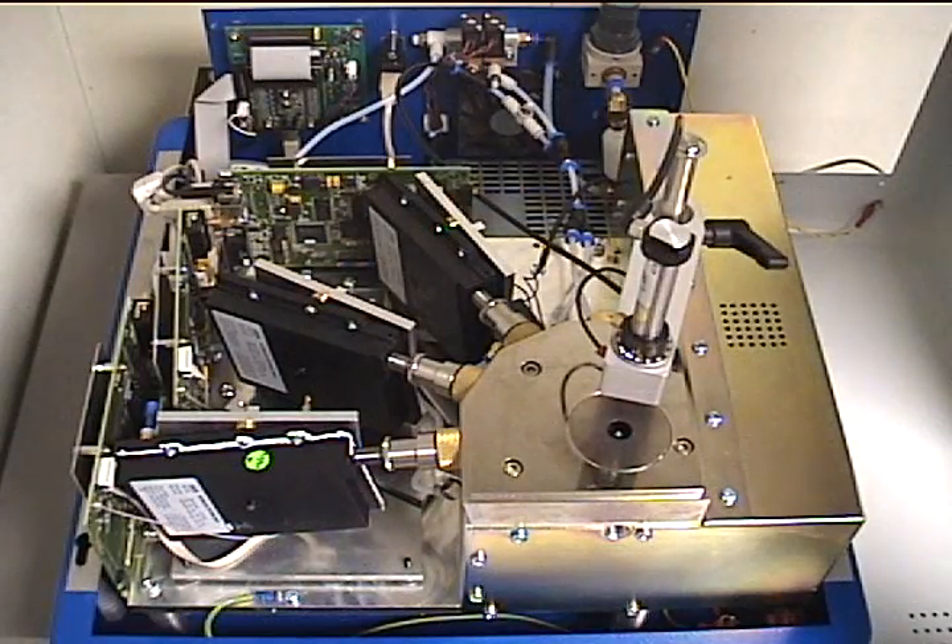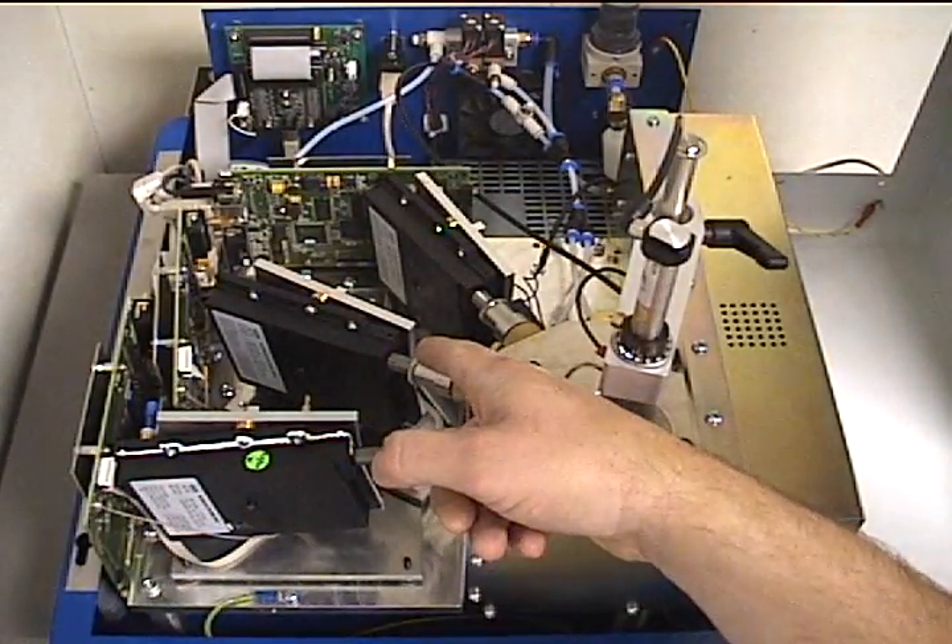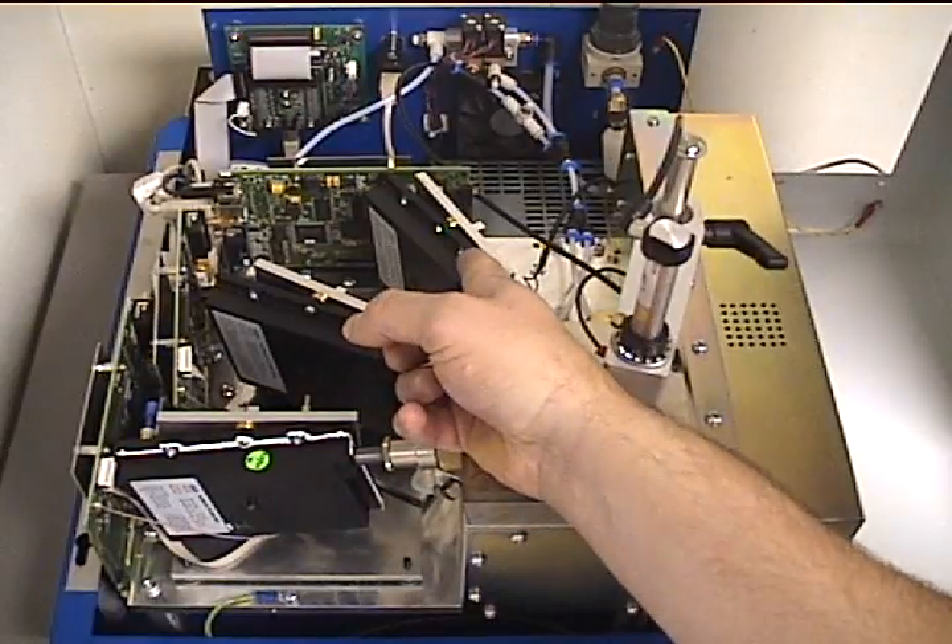Under the hood, the PolySpec is neatly laid out and not as complex as one might think. As in the previous diagrams, the optical cells are laid out around the spark stand area to be able to view the light from the sample. Here we can see that this is the PolySpec F unit with optics 1, 2, and 3 connected.